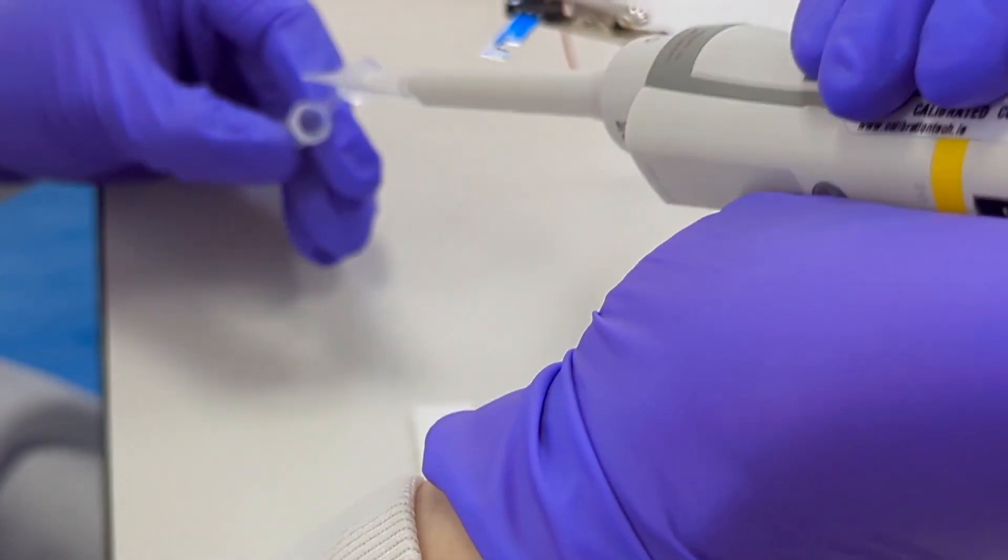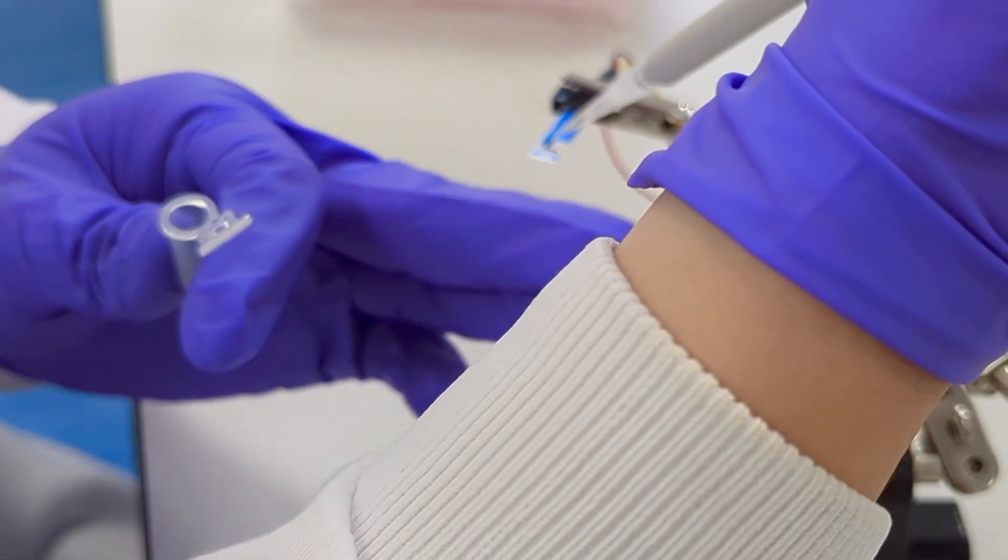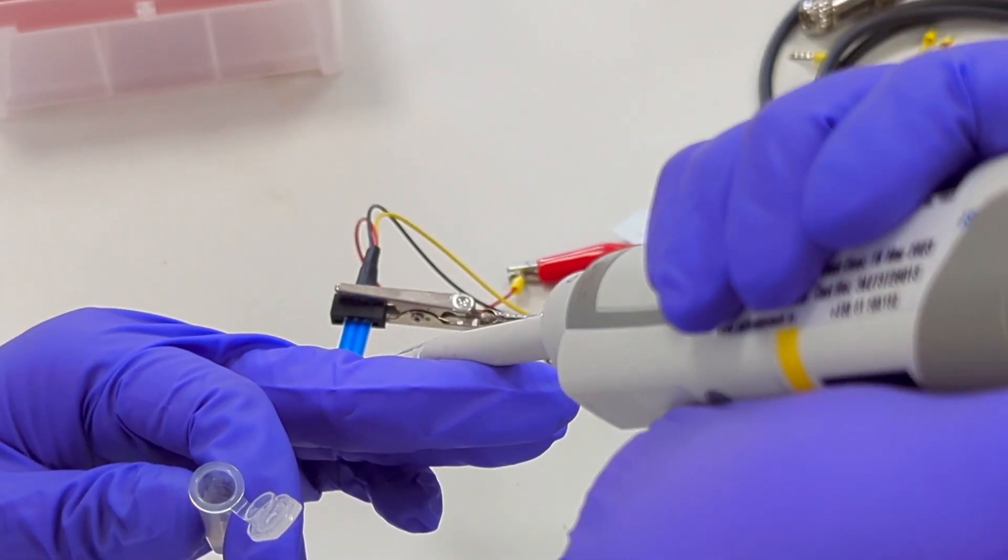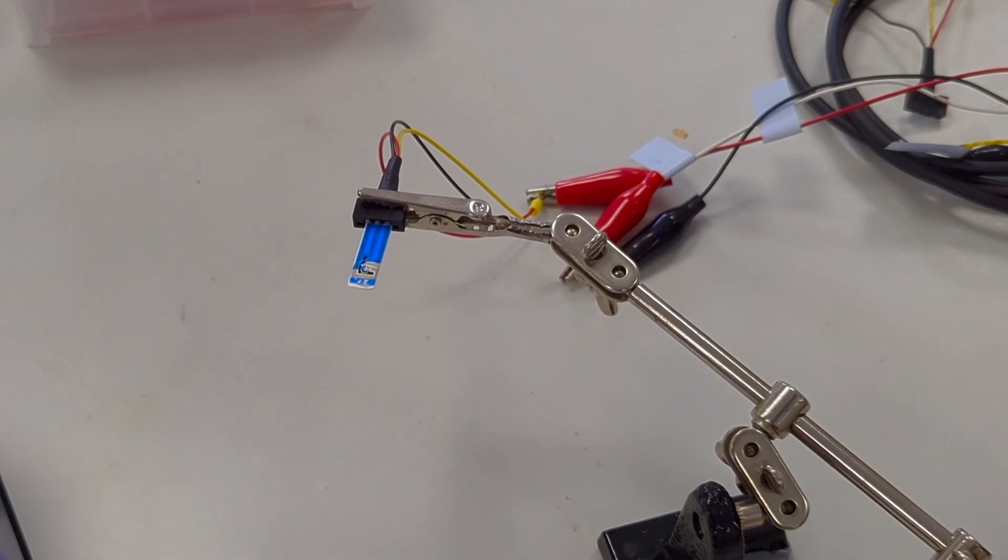Then we prepare 40 microliters of the second sample onto the sensor surface. Once all the electrodes are covered, we can start the electrochemical measurement.